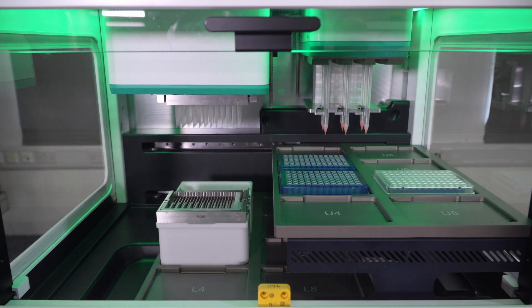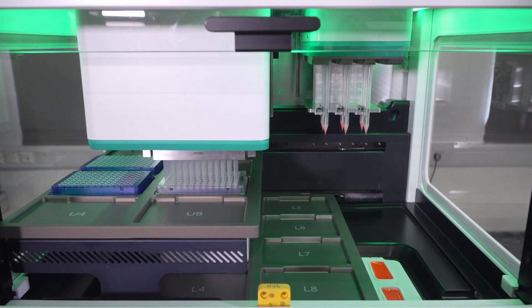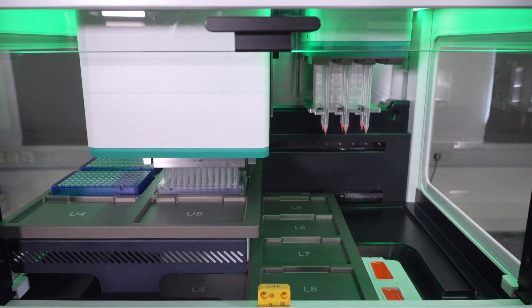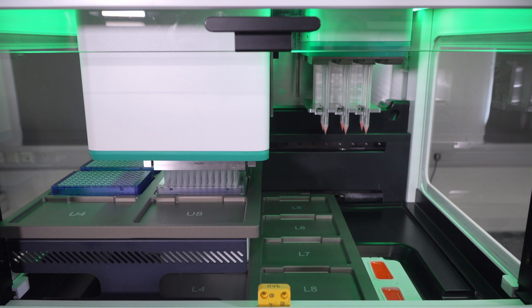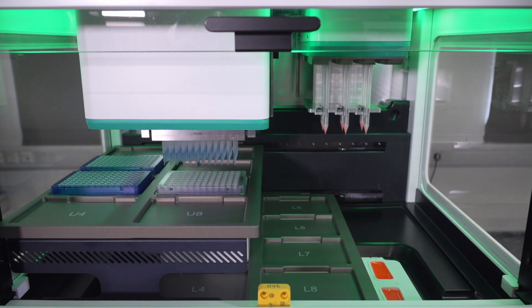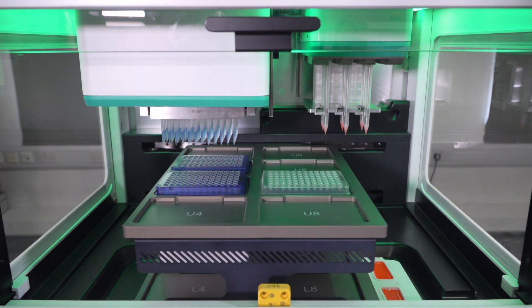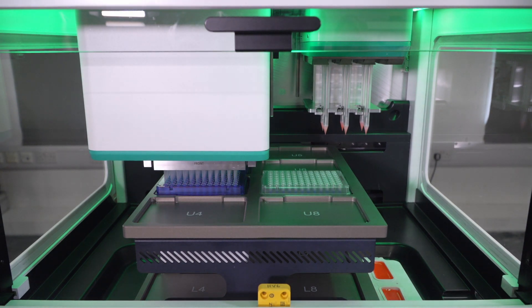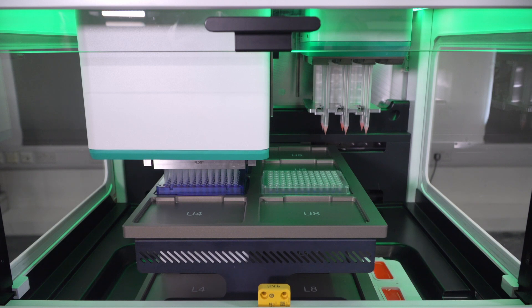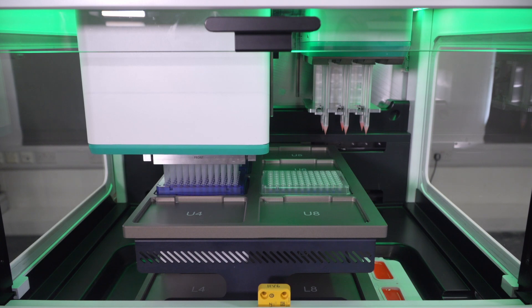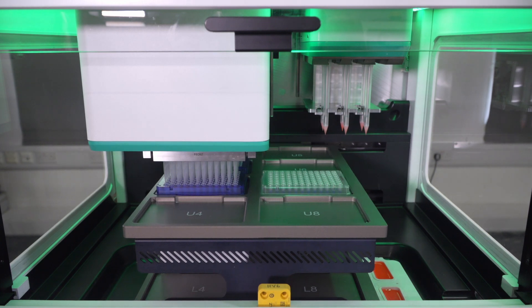And then the tips would move into the source plate, aspirating an air gap, and moving into the liquid to aspirate some of the liquid. Now you can see the liquid going up. And now the liquid is transferred into the intermediate plate. We're doing that in order to prevent contaminating the sample in the source plate. So we're creating an intermediate plate from which we will perform the pooling. Now you can see the liquid got dispensed.